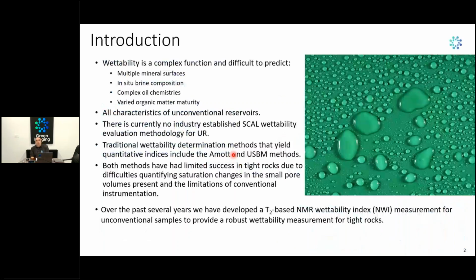As a quick introduction, as everybody knows, wettability is the affinity of a fluid to a surface. In rocks, it can depend on many things, including the mineral composition of the surfaces, the composition of the in situ brine, the complexity of the oil chemistries, and the maturity of the organic matter in the pore volumes. And these are all characteristics of unconventional reservoirs. So this makes determining the wettability of unconventional reservoirs difficult.